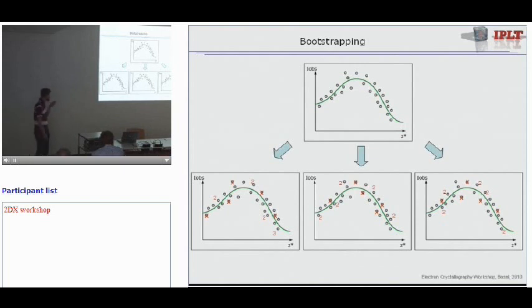The advantage of this is that you get a much better estimate of how well you've fitted, what the signal of your fitted points is, because it's otherwise quite hard to get precise. So that's a method to get a better weighting afterwards for the fitted points. The disadvantage is that it's not just one lattice line fit, it's several lattice line fits, so it takes somewhat more time. But normally, at least in my opinion, it's more important to have a higher precision instead of having faster processing. And today's computers are normally fast enough to handle that.